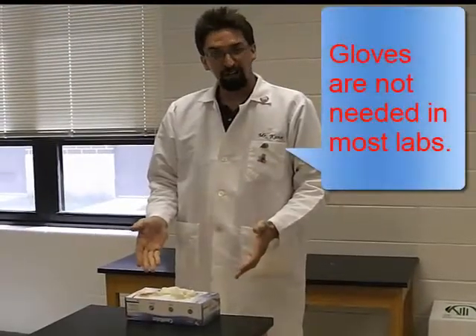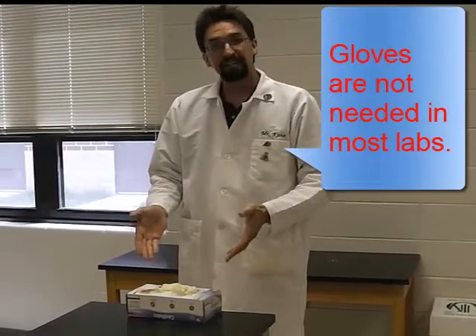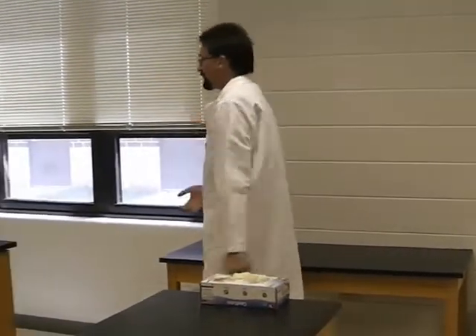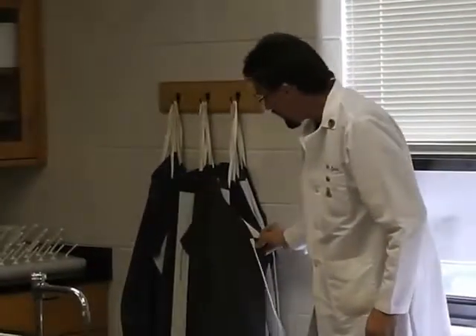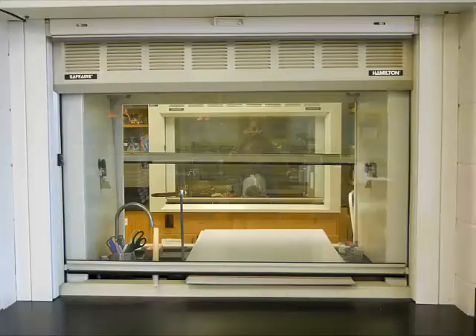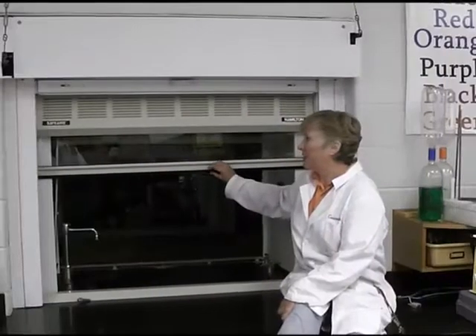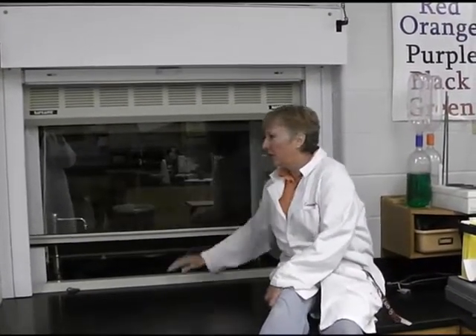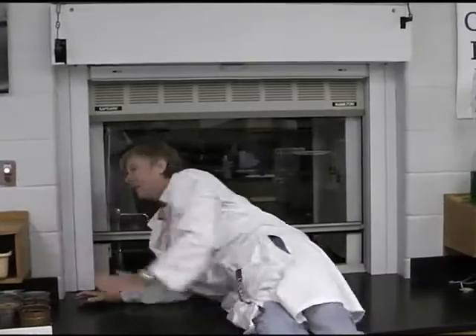If gloves are available, they will be put out. Please keep in mind that if somebody has a latex allergy, we won't be using gloves. The other side of the lab also has lab aprons. This is the fume hood — there is one in every science room. As you can see, you can see into the next room and there's their fume hood. When it's in use, the chemicals are inside the fume hood, the door is shut, and all that poisonous gas is being sucked up and out into the atmosphere.